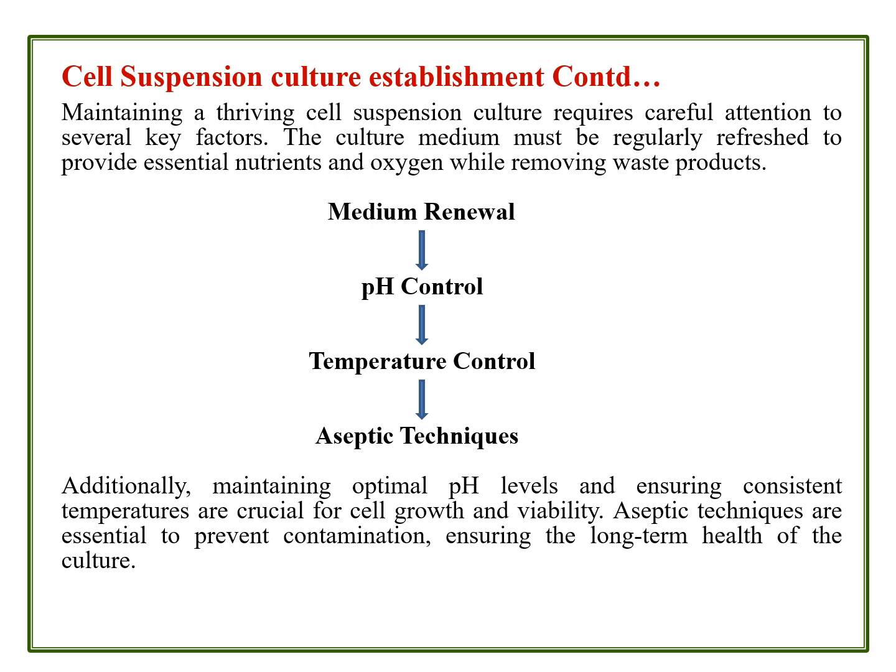The culture medium must be regularly refreshed to provide essential nutrients and oxygen while removing waste products. So the protocol involves medium renewal. If it is a continuous stirred tank reactor, the medium is added continuously and the product or cell aggregates will be harvested from the medium.